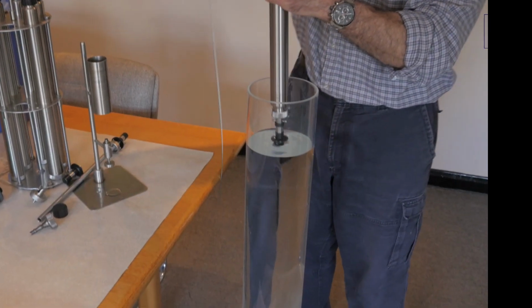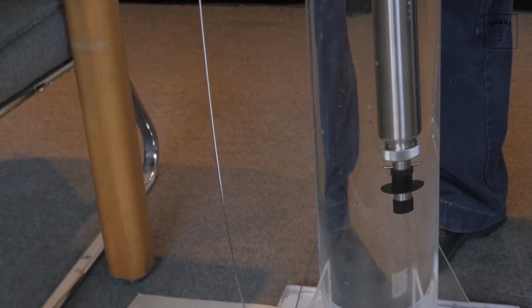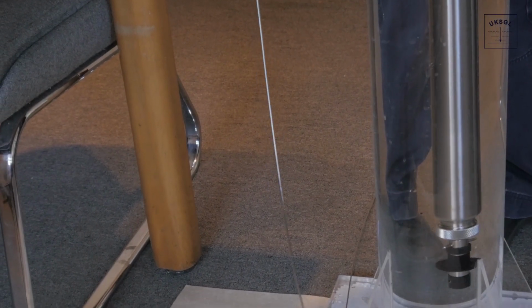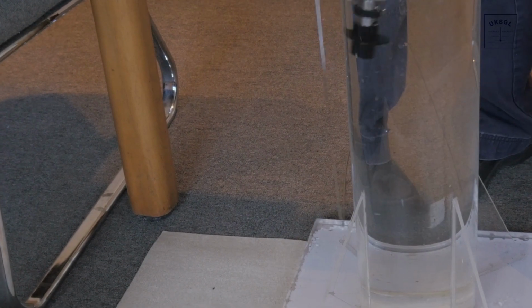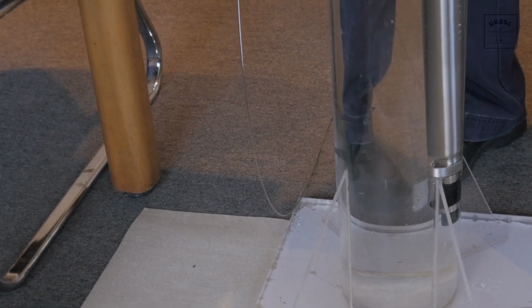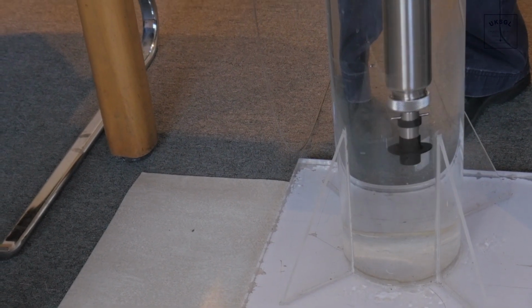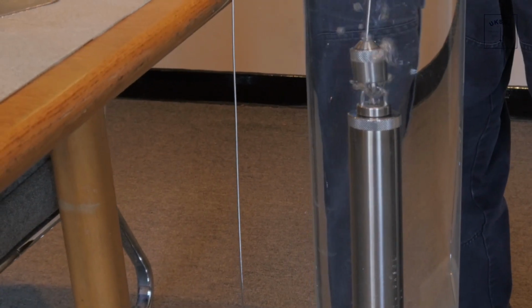In this demo, you can see that the probe valve is closed by the action of lowering it into the liquid. At the appropriate depth, as measured by the tape counter, the sampler is pulled slowly upwards. This causes the valve to open. Note, sharp jerks shouldn't be used as the sampler will jump up, then settle back down, which will make the valve closed.